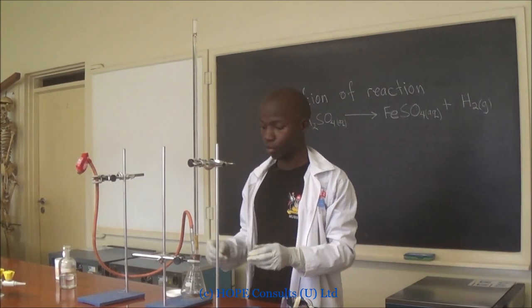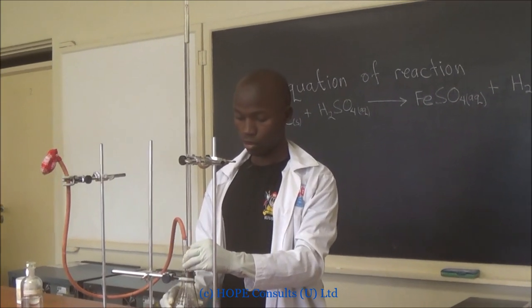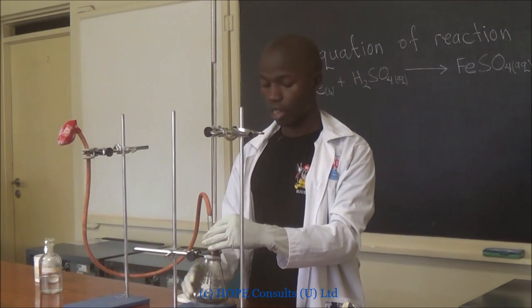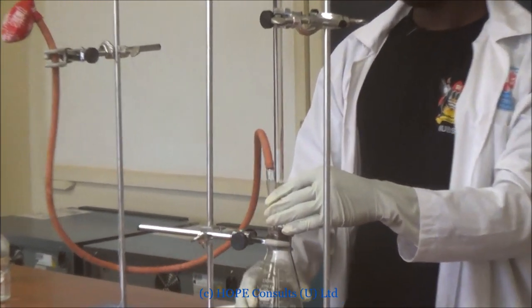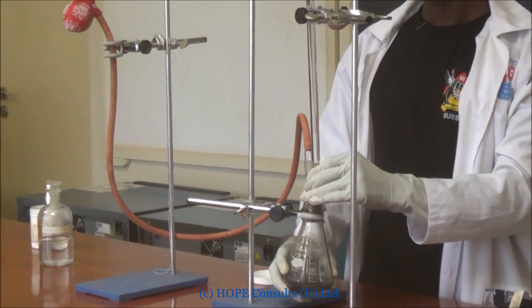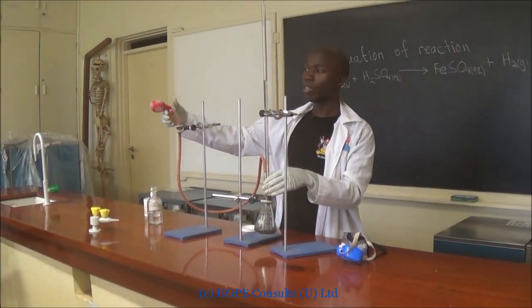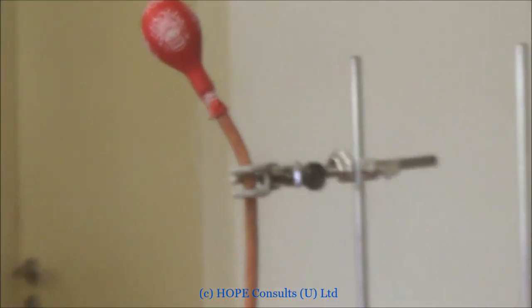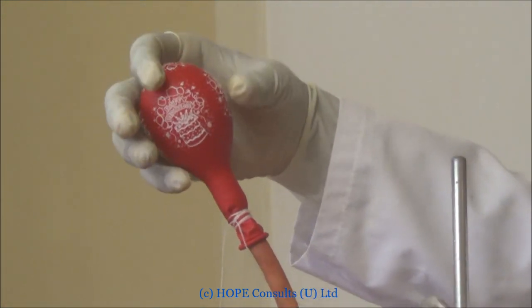It will start. I release the sulfuric acid until it finds the iron in the conical flask. The reaction is taking place here. The gas is collecting into this balloon — you can see it is enlarging.